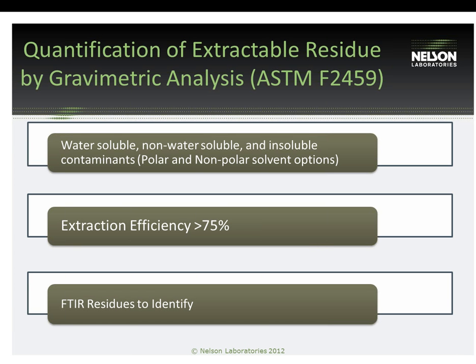Another benefit of this gravimetric test method is that we can take the residues and scan them on the FTIR and attempt to ID components in the residue. And the FTIR, which stands for Fourier Transform Infrared Spectroscopy, where we take that infrared beam, scan those residues, and then we're able to get a spectrum of bonds or functional groups. And then we have a library of known compounds where we compare the residue to the library and try to get a match. And then we're able to report those results to our client based on what their matches are.